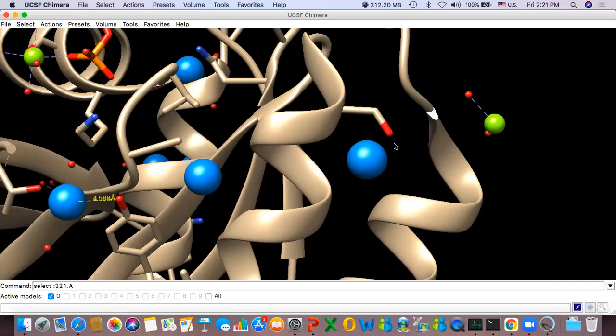So again, I'm doing this. I'll press the Control button and my left mouse button, I click the atom of my interest, and that's how I make a selection. And with Control and Shift both pressed on, you select the second atom, or third, fourth, whatever you want to do. I think you would have done this for torsion angle. That's how you find the torsion angle.